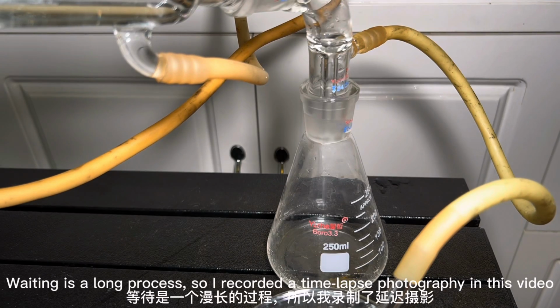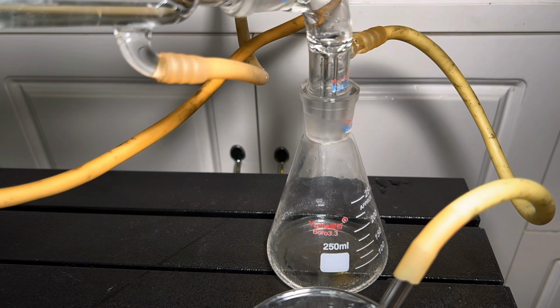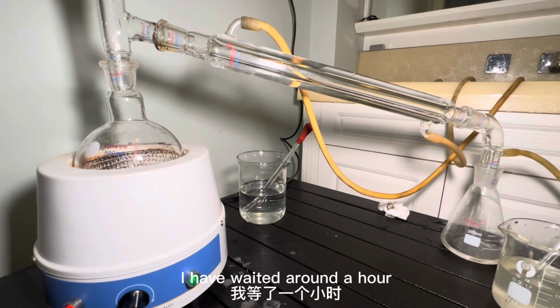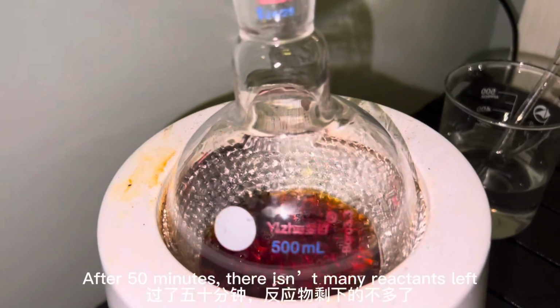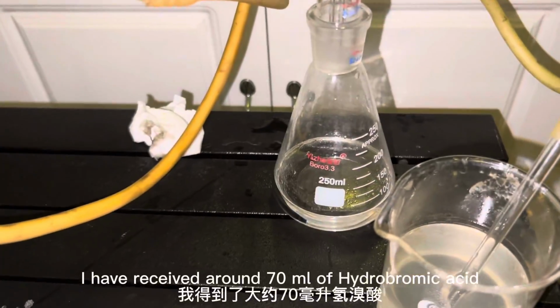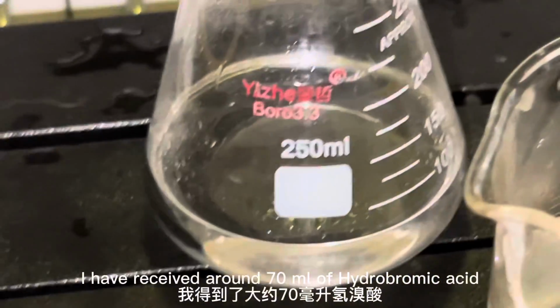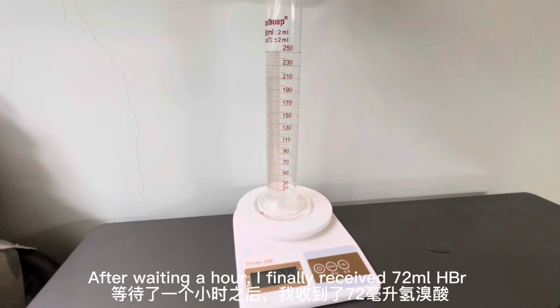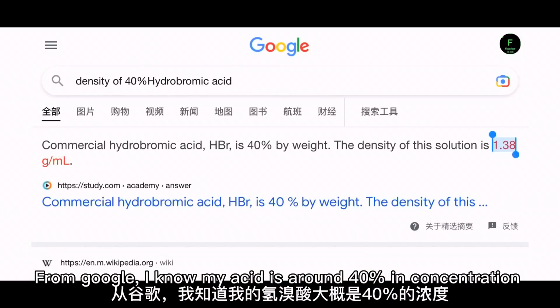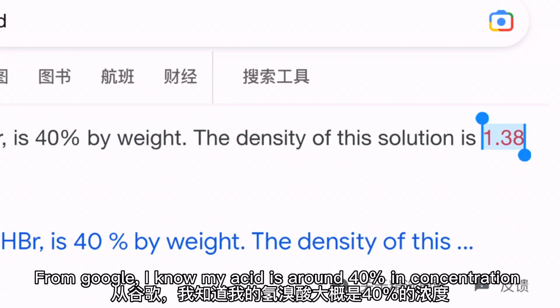Waiting is a long process, so I recorded a time-lapse in this video. Though it's still pretty slow. I have waited around an hour. After 50 minutes, there aren't many reactants left. I have received around 70 ml of hydrobromic acid. After waiting an hour, I finally received 72 ml of hydrobromic acid. And from Google, I know my acid is around 40% in concentration.